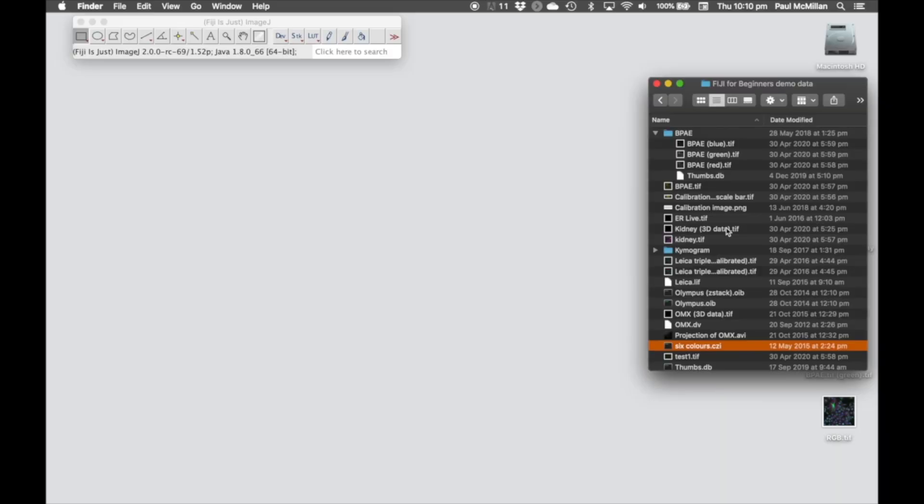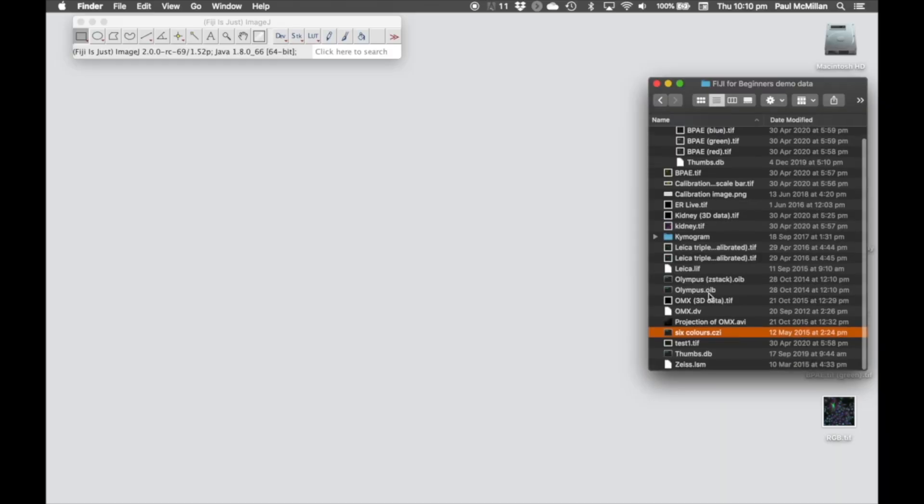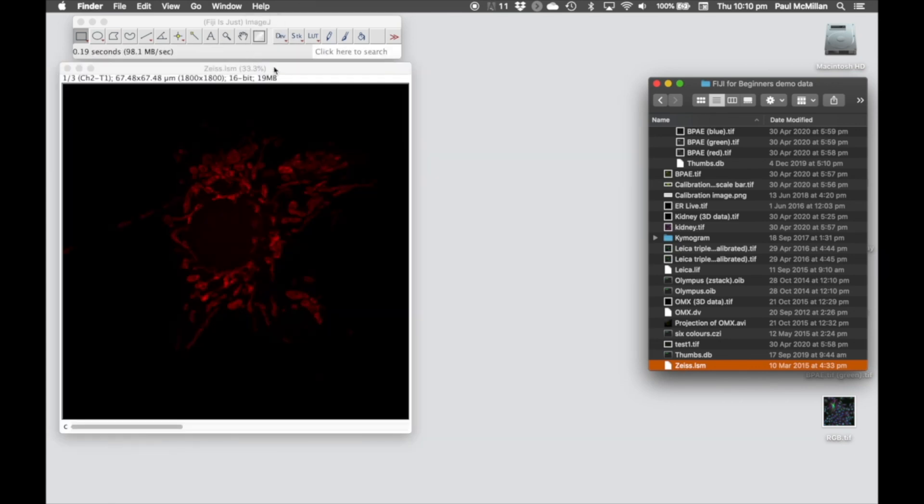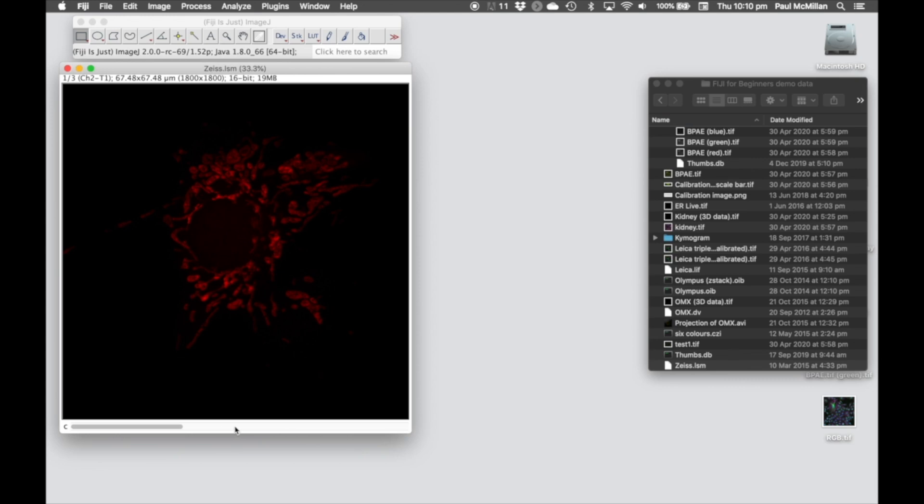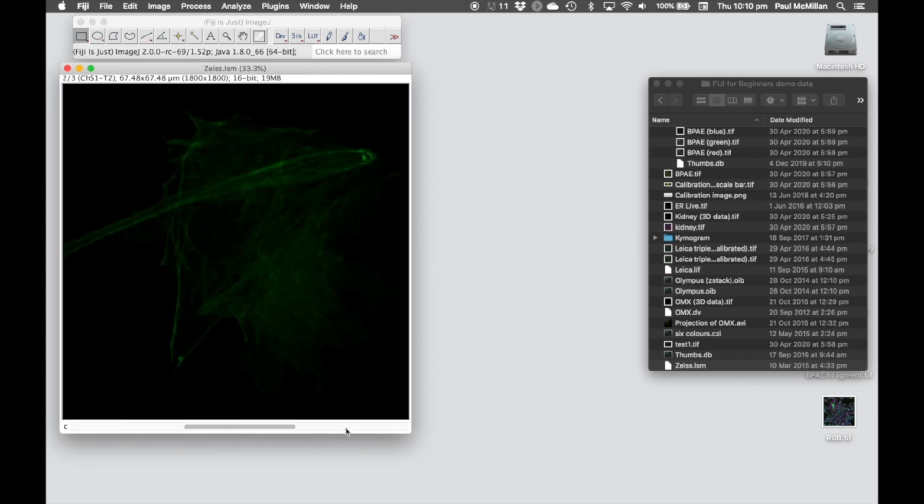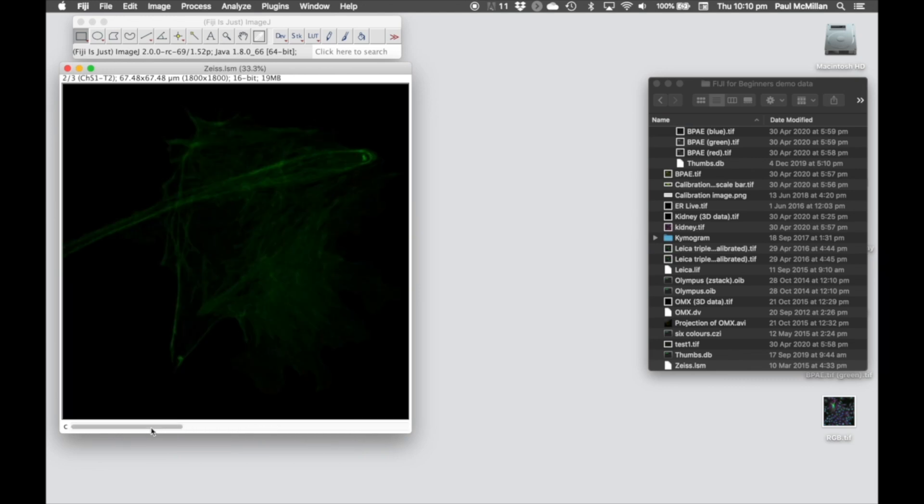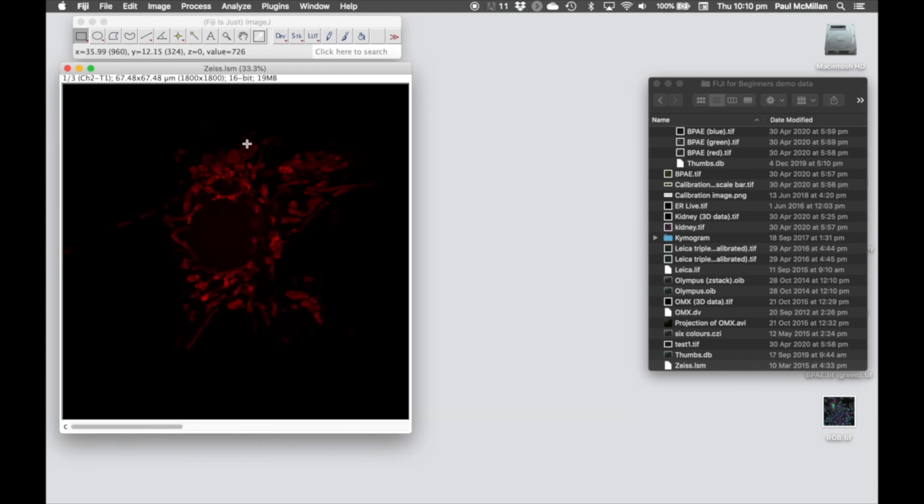So for this, we're going to use the Zeiss.LSM image. Here we've got three channels, and we want to change the colors that those are shown in.